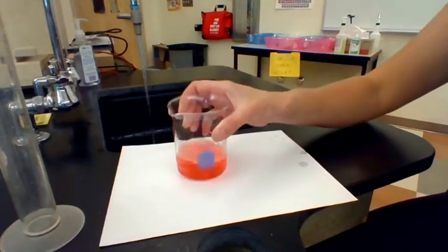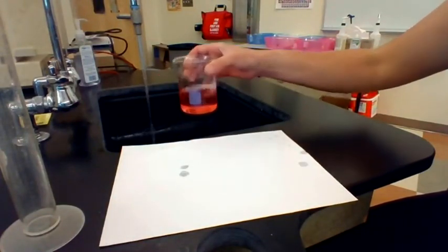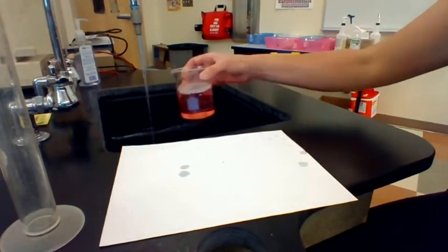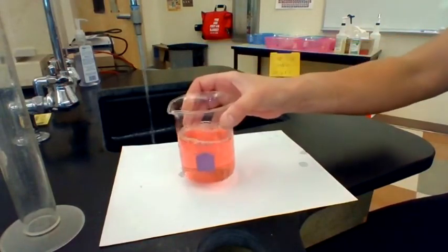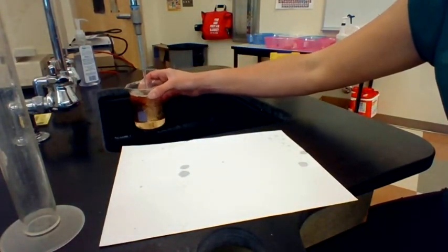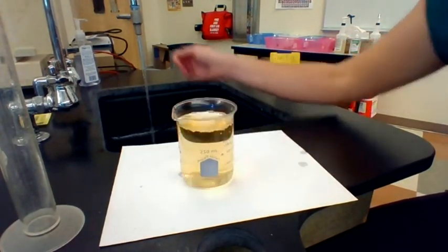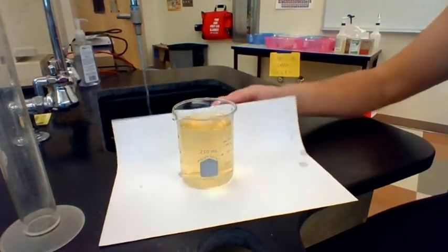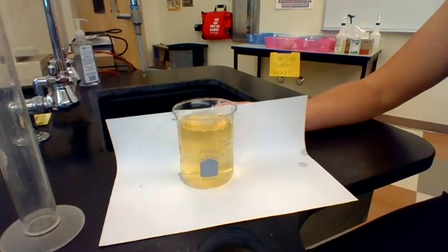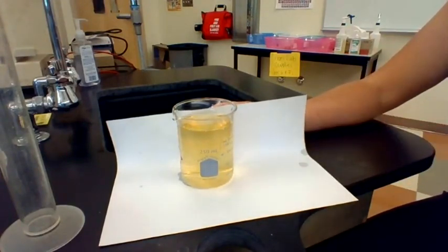Okay, so far now I've had about 100 mils, still pretty red. Now I'm up here about 150, solution still red. I'm here at about 200, the solution's still red. And oh, there we go. Once we hit maybe 250, it finally started to change color. And it's still not even quite neutral. It's yellow. So we see with dilution, it's going to take a lot of water to change the pH here.